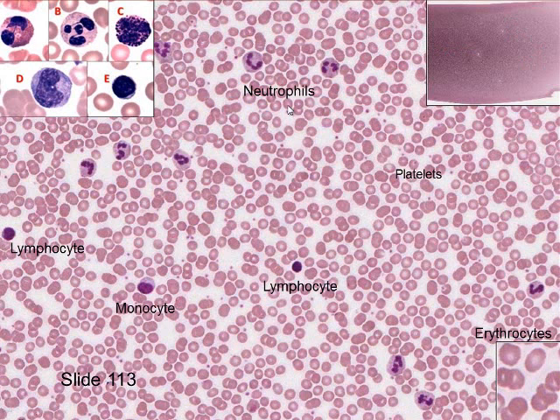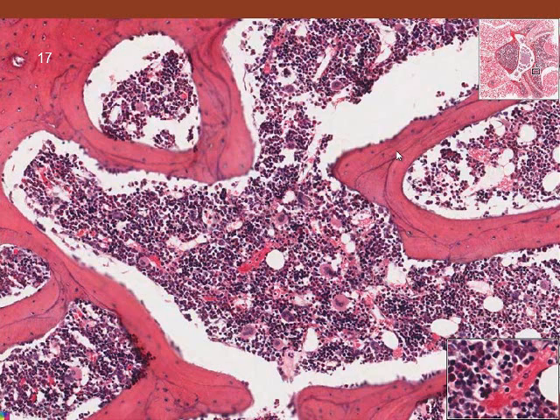So in terms of summary, we have neutrophils. There's more neutrophils. We have lymphocytes. We have monocytes with a lot of cytoplasm. Lymphocytes, more red blood cells, erythrocytes, more, and platelets. So these little dots in through here are platelets that we can see. And of course these cells come from bone marrow, and so we see the bone marrow in through here.